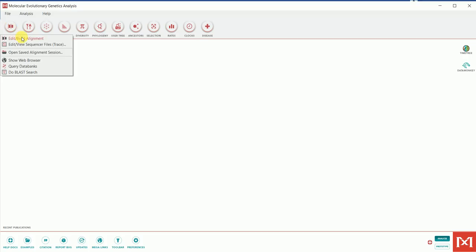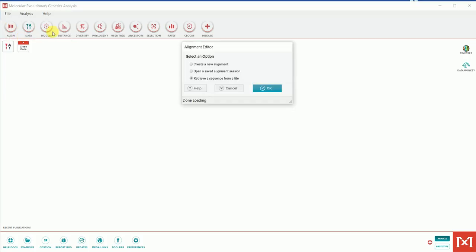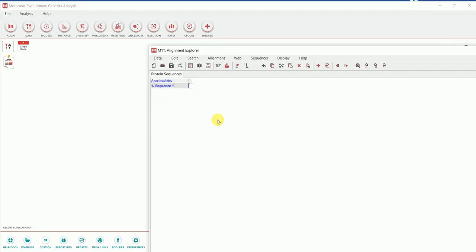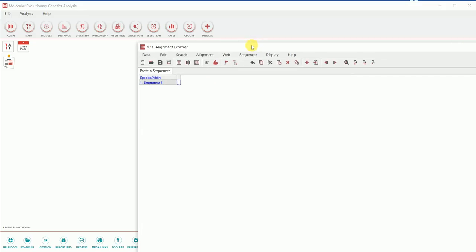After clicking 'Edit or Build Alignment,' it gives you several options: create a new alignment, open a saved alignment session, or retrieve a sequence from a file. Since I don't have a saved session, I'm going to create a new alignment. It then asks whether you're building from DNA sequences or protein/amino acid sequences. Since I'm performing phylogenetic analysis using amino acid sequences, I'll click on 'Protein.'